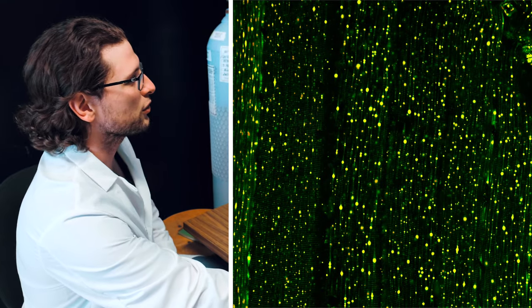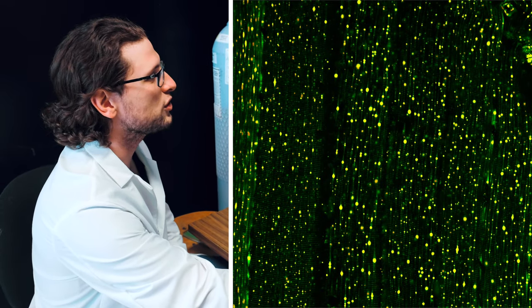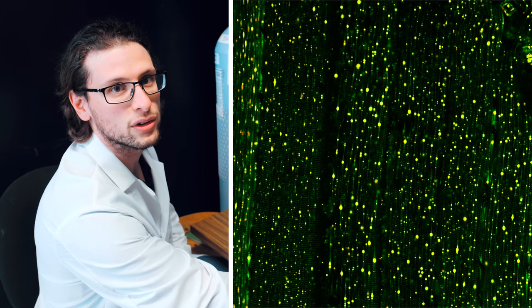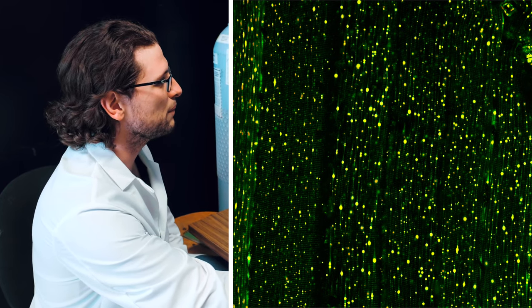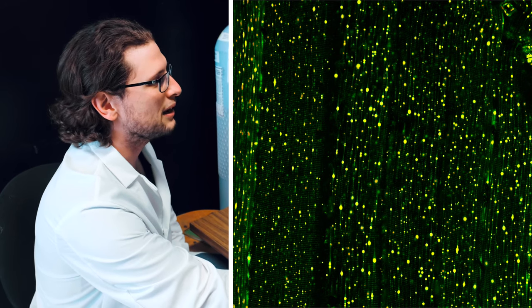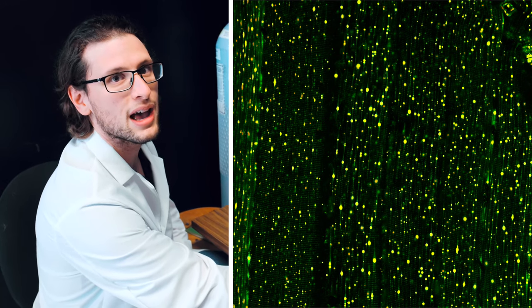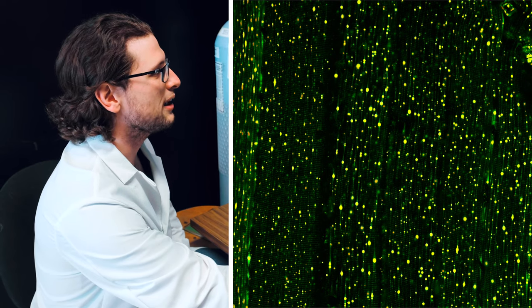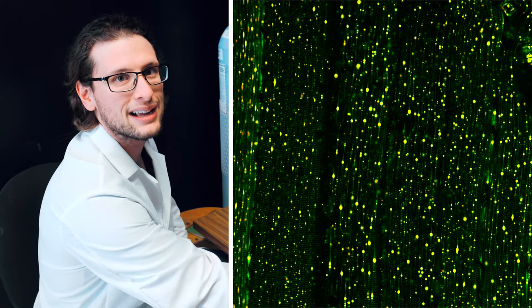The last thing I want to show you is an image of a live muscle. You can see green and a reddish-yellow color — this is called mitokyma. The green represents healthy mitochondria, whereas the reddish-yellow color represents mitochondria that are actively undergoing degradation in the lysosomes through mitophagy.